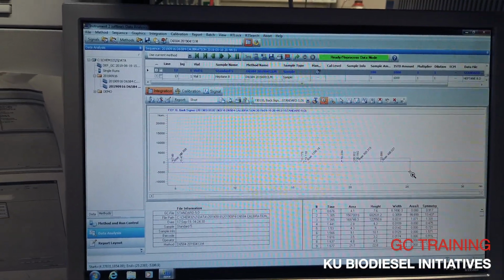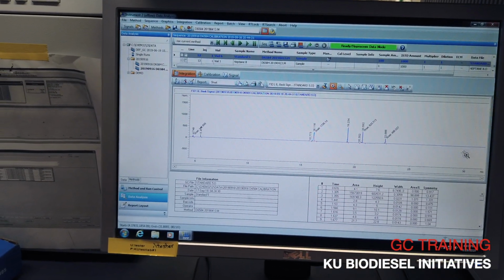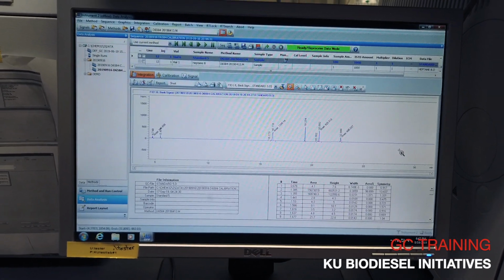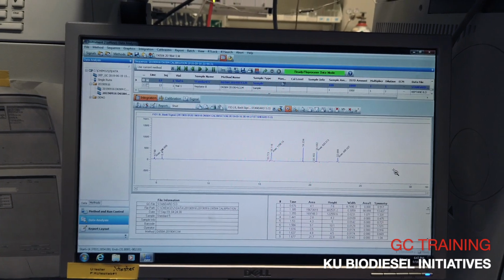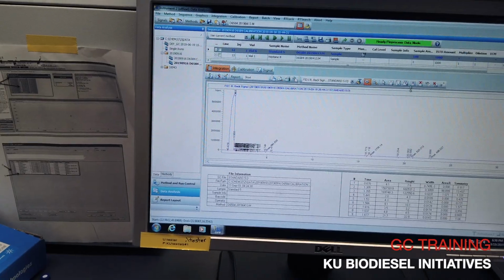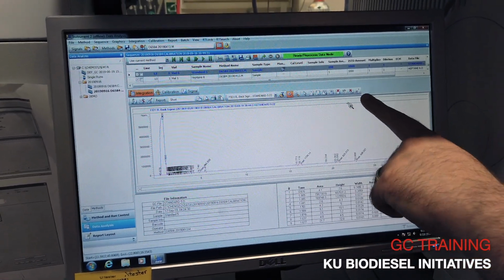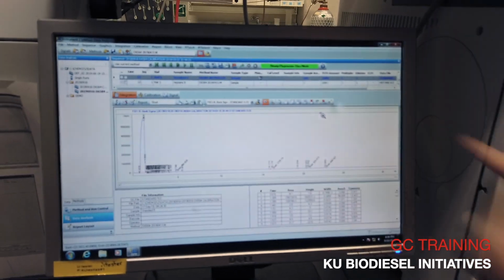So if we get to the point where this feels overwhelming to do in one day, then that's perfectly fine, because I'm obviously doing this way slower than I normally would, so I can explain everything in detail. When you're doing the calibration, you want to constantly be clicking this save button, because that means you've actually manually integrated it. If you go through and do all of it and don't click save, and you click it off, then it's gonna be like, okay, bye.